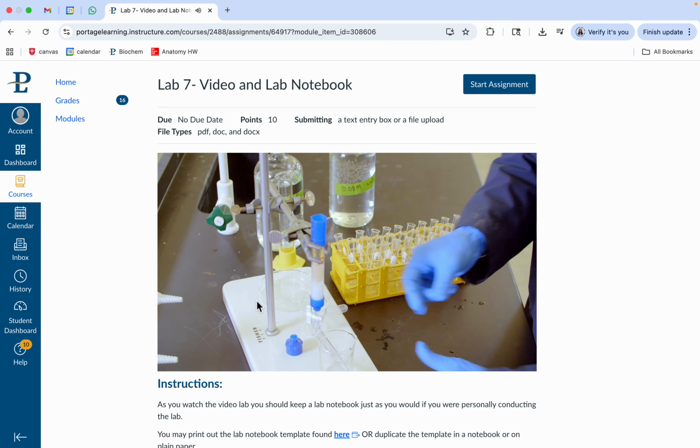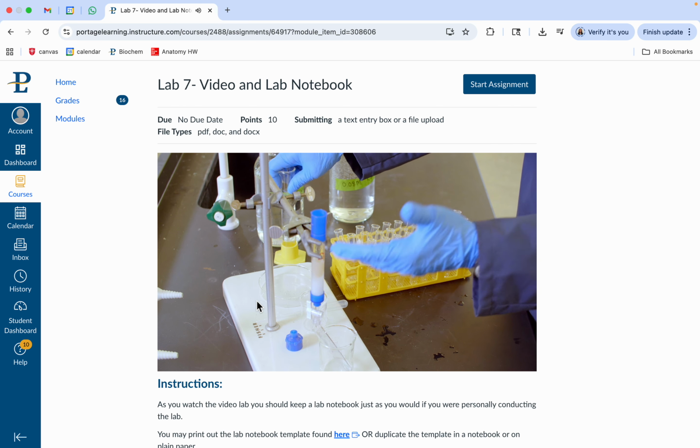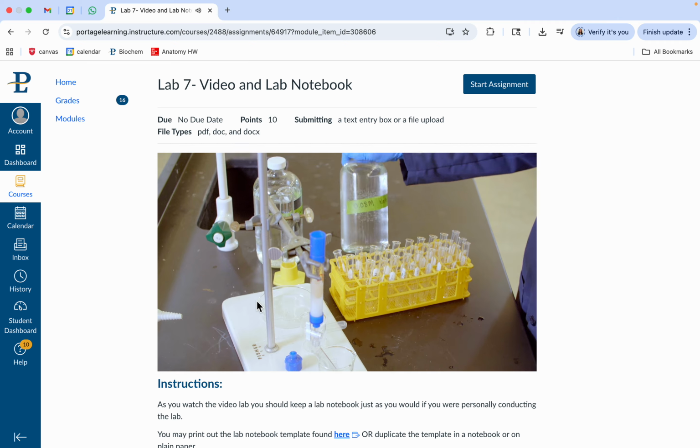Right now, let's start. This first couple weren't part of it, so we'll start collecting fractions, and we're going to collect 30 total test tubes. We're going to use 20 milliliters of this on top. And then once that 20 milliliters works its way through, it'll pull out other proteins that may be negatively charged. It won't be attracted to the column that much. And then we're going to move on and get 40 milliliters of a higher concentration, 0.08 molar sodium acetate.